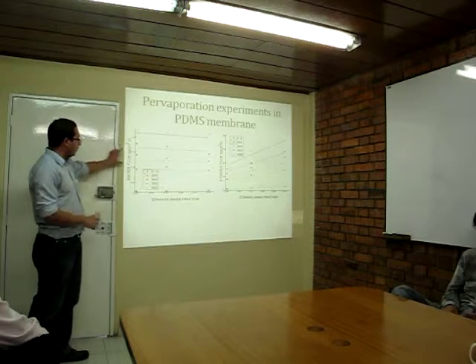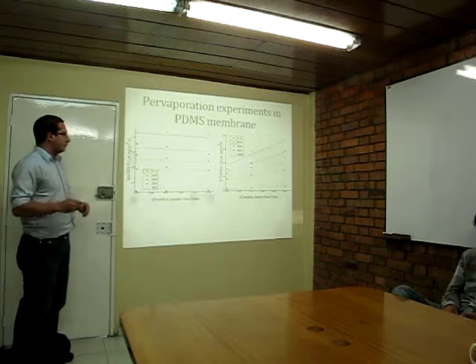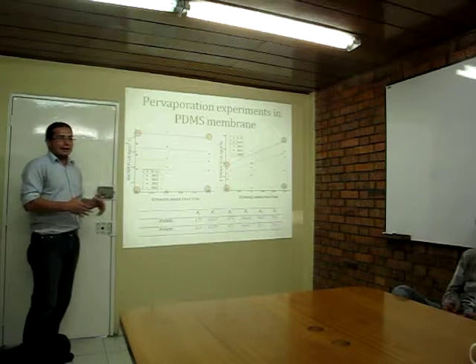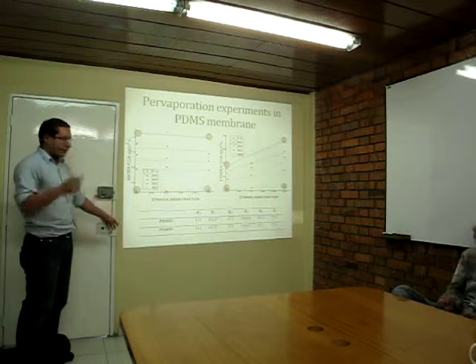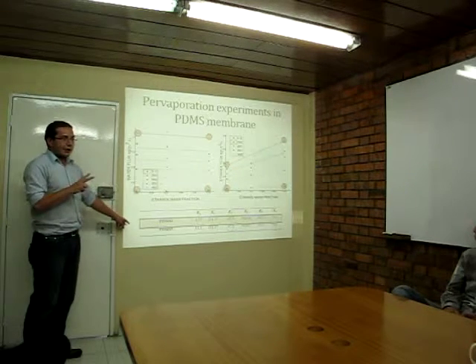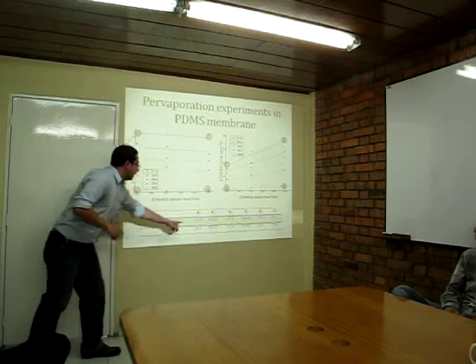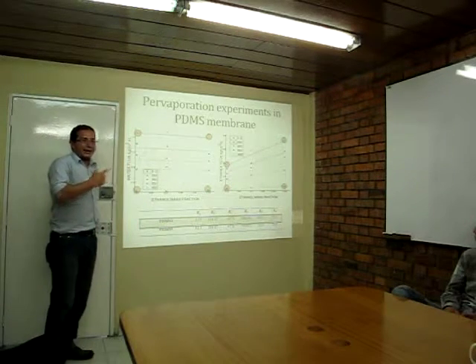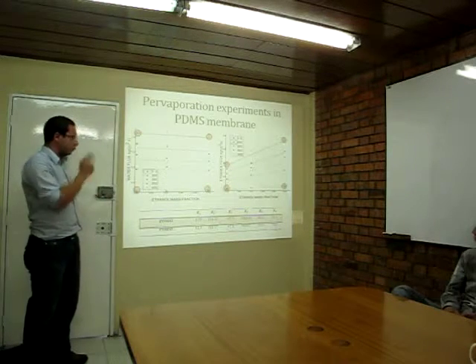We take this membrane and we test it at different temperatures and mass fractions of ethanol. This is the behavior of water flux and ethanol flux. With this data, we test the mathematical model and we minimize these constants. We can see in these constants that these two kinds of membranes, a bad membrane and a good membrane, have only one difference in their constants, and it was the constant of drag of water. It is the only difference between the two membranes.